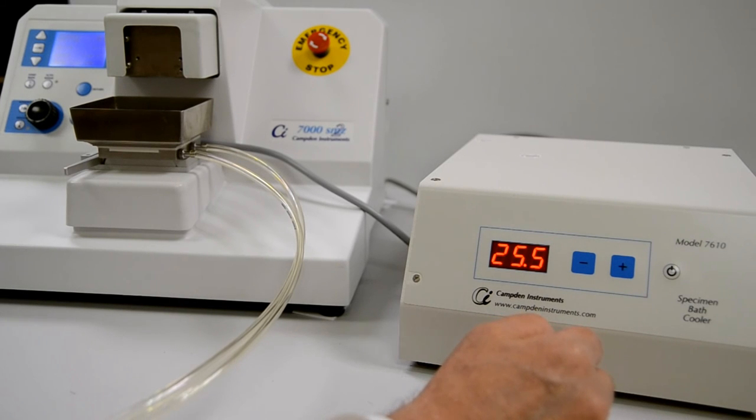The display will show the temperature of the surface of the cooling unit. Pressing either the plus or minus key once will display the set temperature. Repeated pressings of the key will change the set temperature. The display will revert to display the current temperature a few seconds after the last key press.